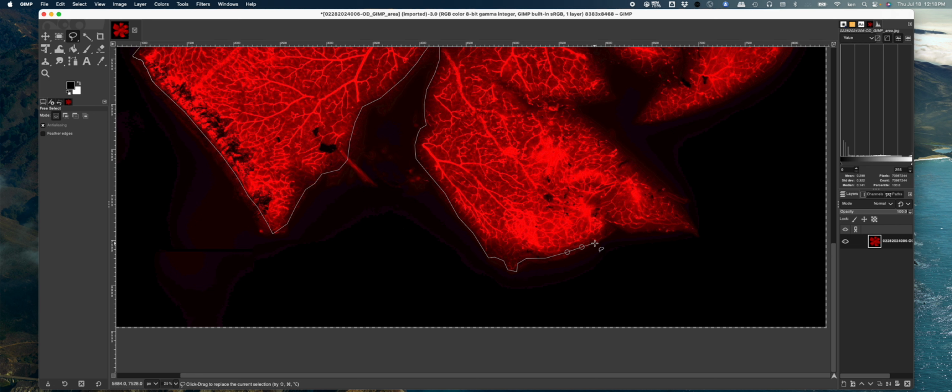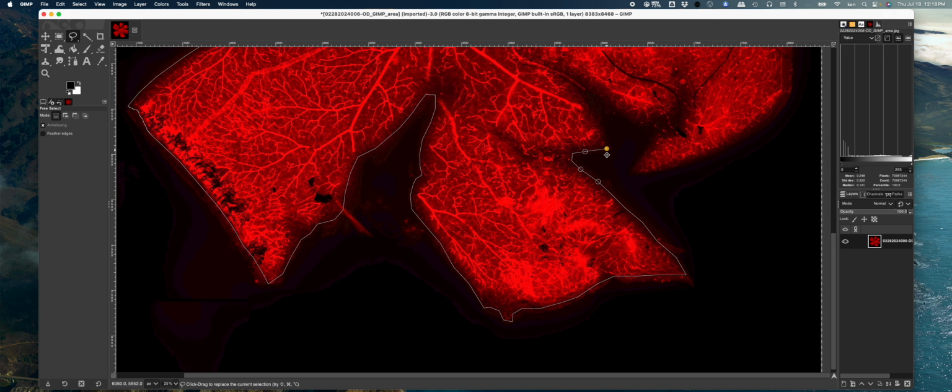What type of mouse you use will really depend on how well you can use that mouse. If you need a drag touchpad or a different kind of mouse, that's to be figured out by the user. I'm doing this right now on my MacBook Air, and the touchpad mouse is quite nice in my case.